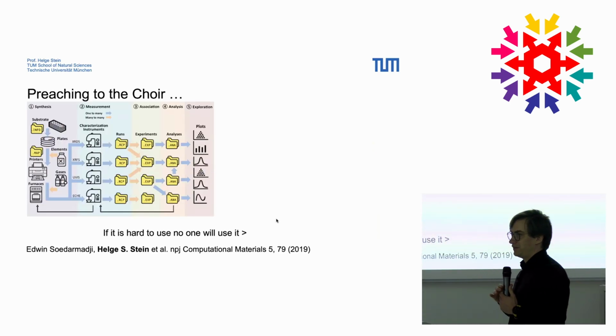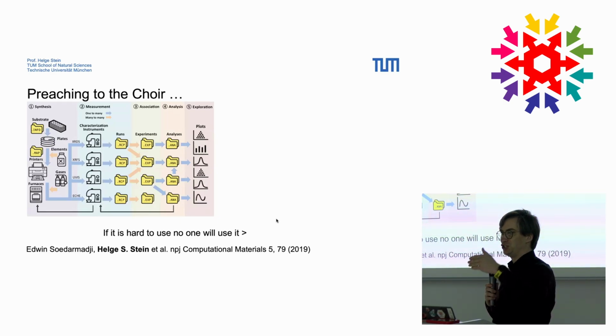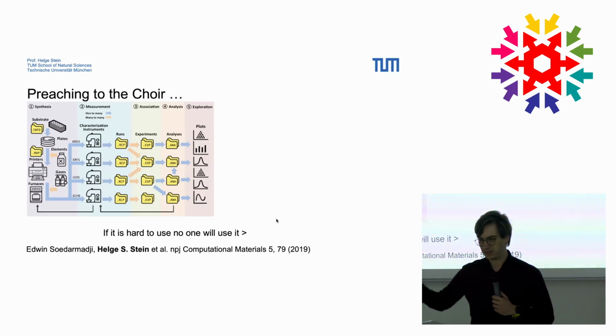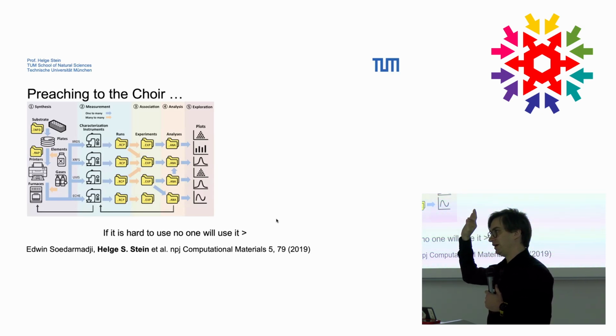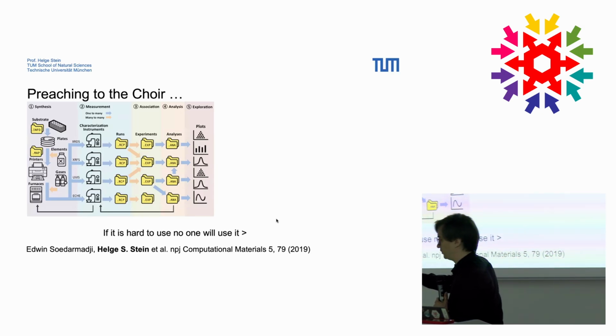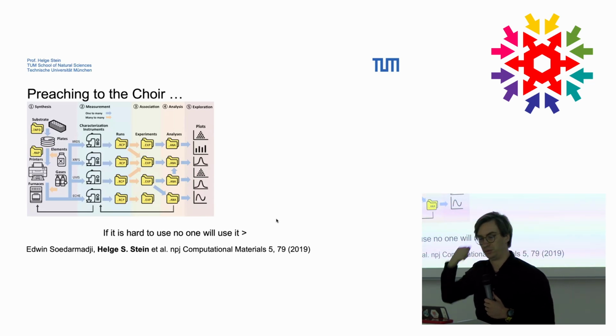So I believe that here I'm preaching to the choir if I say this is super important, that you shouldn't just keep track of how you analyze your data. You should also keep track of what you did to your samples. So this is from a relatively old publication we did at Caltech, where we did not just keep track of the experimental data analyses that we did. So the idea was always whenever we have a plot and a point in that plot, we could always trace back to essentially what kind of gases, what printer, and what precursors we used.